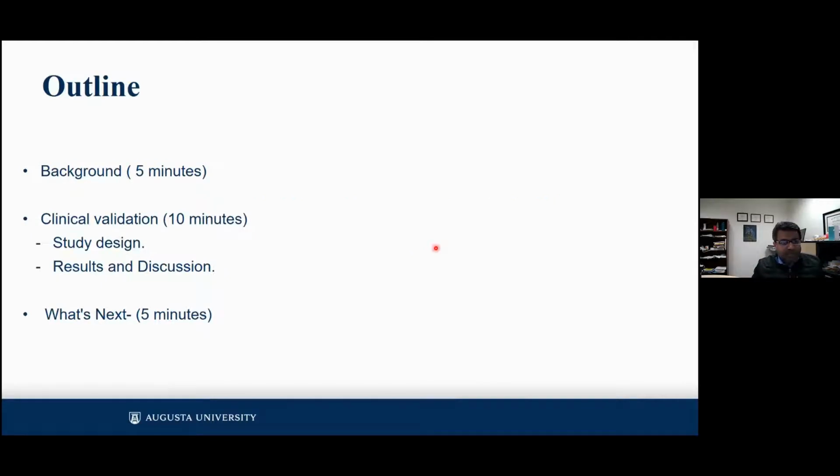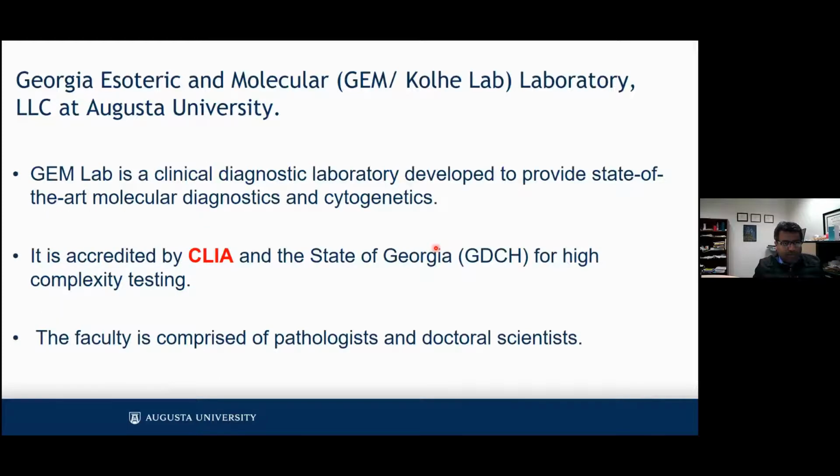This is my outline. In the next 20 minutes, I want to take you all on the journey of our experience of working with the Saphyr optical genome mapping on adult brain tumors. A little bit of background about who we are.